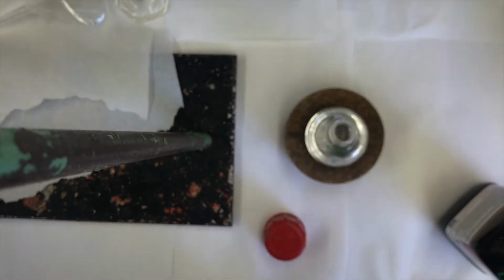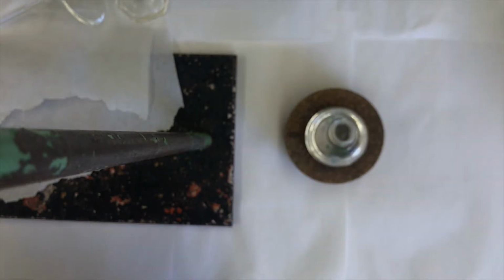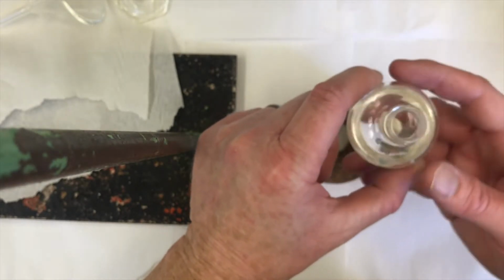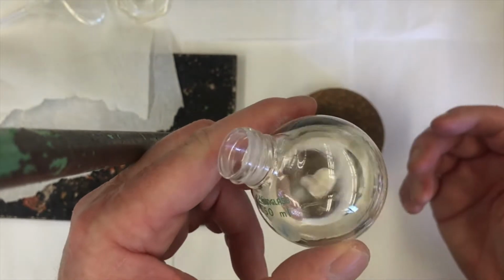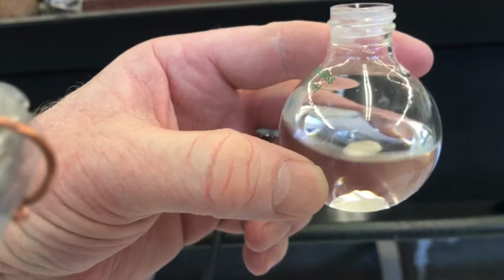Next, we need to add a magnetic stir bar. Going to stir this distillation. I could use boiling stones, but I'll use the stirring method. So I've added my stir bar. My solution looks pretty good. I saw some mixing lines. Looks like it's miscible though.